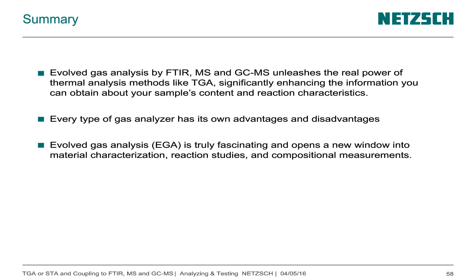With the MS, the problem sometimes is that the HF reacts with the transfer line. With a quartz transfer line, it causes some reaction. If you have a steel transfer line, it should be possible to get it through, or with a skimmer system. I know that a colleague of mine, Michael Feist, has made a publication on detection and quantification of hydrogen fluoride with a skimmer system.